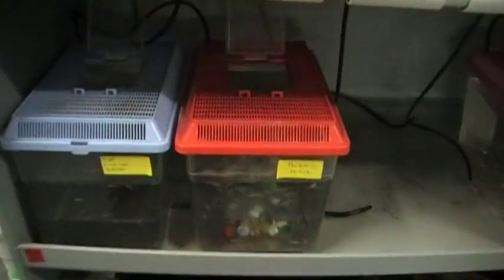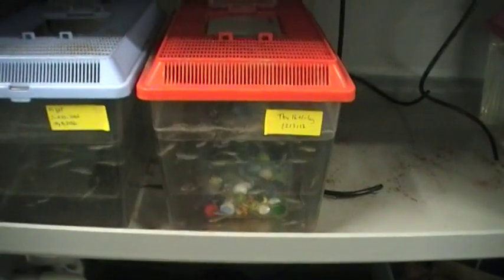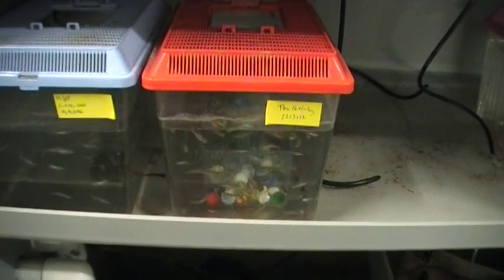Down here, you can actually see a tank where we have a box of marbles in the tank and the fish are laying their eggs over that.